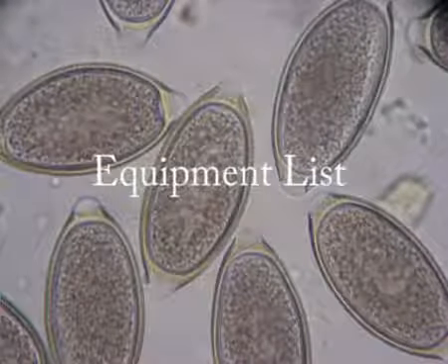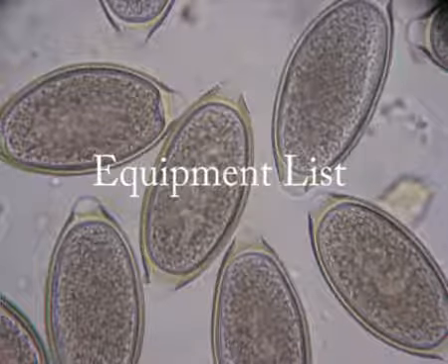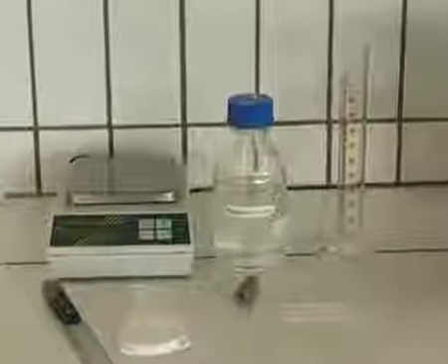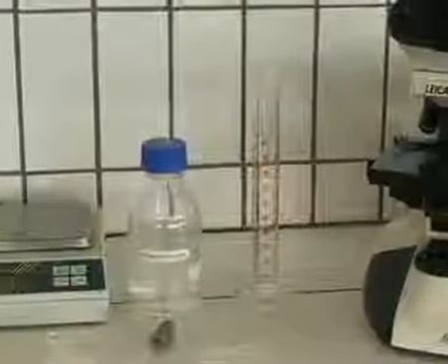Equipment list. To perform a McMaster, the following equipment is necessary: 2 beakers or plastic containers of at least 50 milliliters, a stirring device such as a spatula, a scale, a tea strainer, a Pasteur pipette and a rubber teat, the flotation solution, a measuring cylinder of at least 50 milliliters, a McMaster slide and a compound microscope.